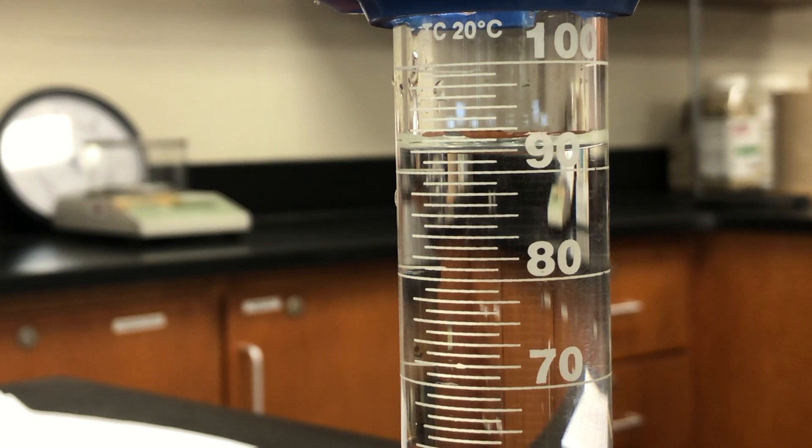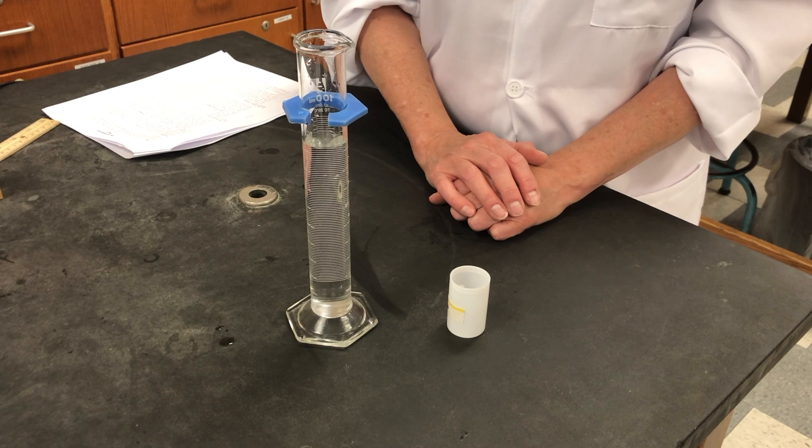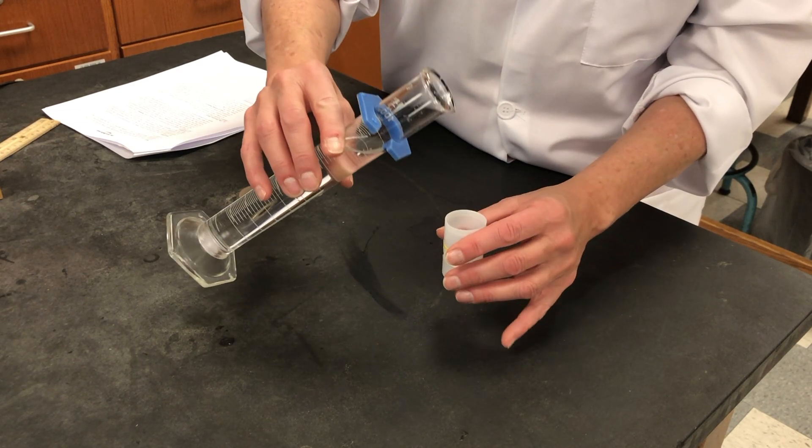Next we're going to grab a plastic cylinder and measure its diameter and height. Record the inner diameter of the plastic cylinder in centimeters. Record the measurement to the accuracy of the ruler — that means estimate an extra digit beyond the smallest increment for proper sig figs. Repeat for the height of the plastic cylinder.